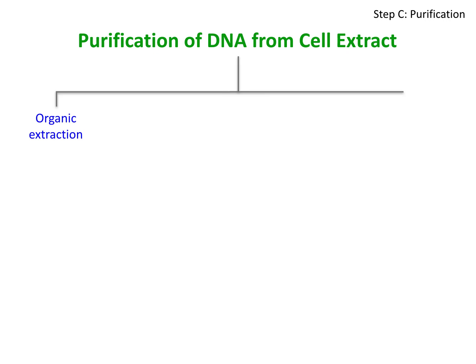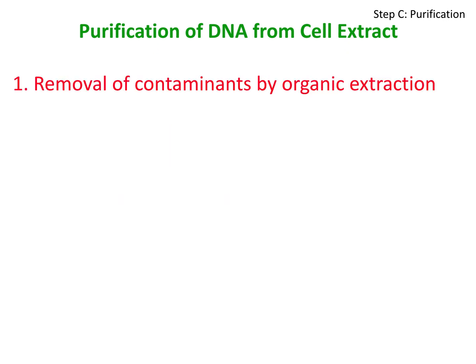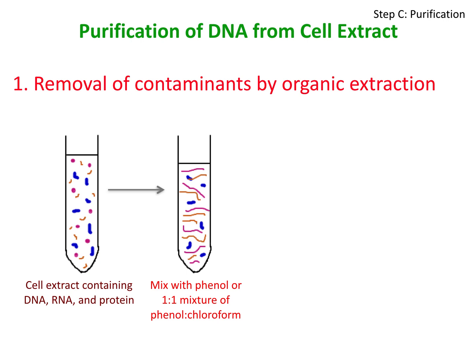The simplest of these methods is organic extraction, in which phenol or a combination of phenol and chloroform is used. This is followed by enzyme digestion using the enzymes protease and ribonuclease. The standard method of removing contaminants is organic extraction. First, an organic reagent like phenol or a combination of phenol and chloroform in 1:1 ratio is gently mixed with the cell extract. After centrifugation, aqueous and organic solutions get separated.